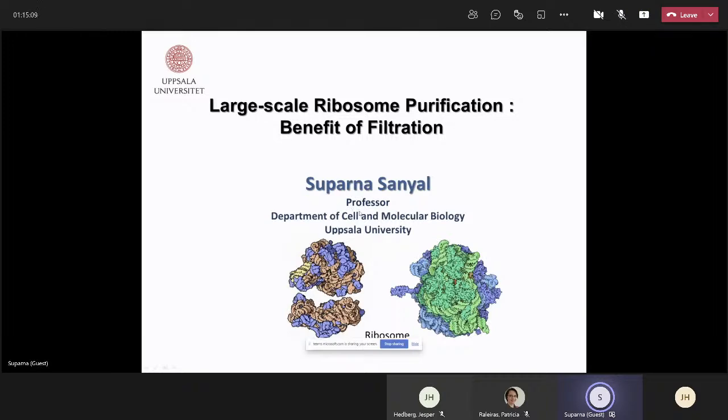Very well. So this talk, since I'm a professor at the university and one of the end users of the technology, will probably be very different from Patricia's talk, but I still hope that the audience will find something interesting and exciting in what we do. The title of my talk is Large-Scale Ribosome Purification, and thinking of the theme of the webinar today, I would like to focus on the benefit of filtration technology in this.